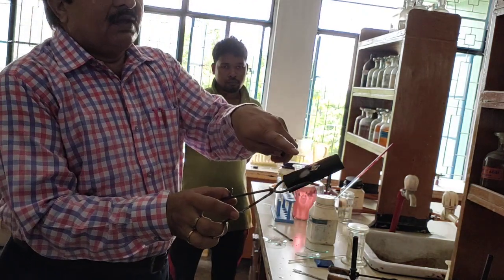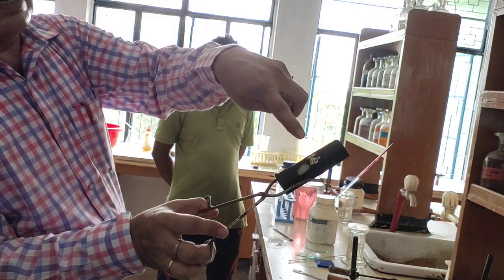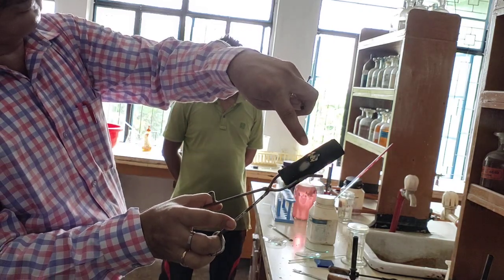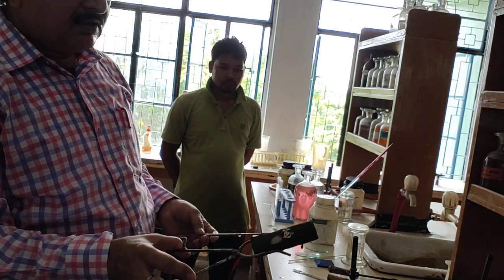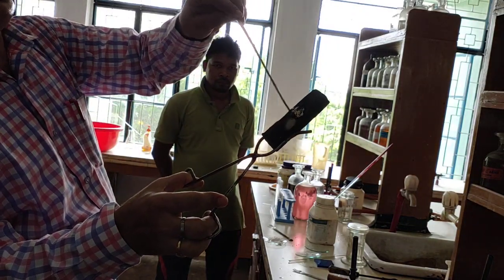See, the color of the salt, first of all, it becomes orange, and just after a few seconds it becomes yellow. When the color of the salt becomes first a bit orange and then yellow, it means salt of lead maybe. Alright. So from this observation we are getting this. See, the color becomes yellow here now.